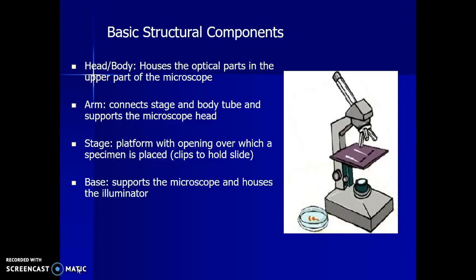Whenever carrying the microscope, you must hold the arm in one hand and place your other hand underneath the base to support it.